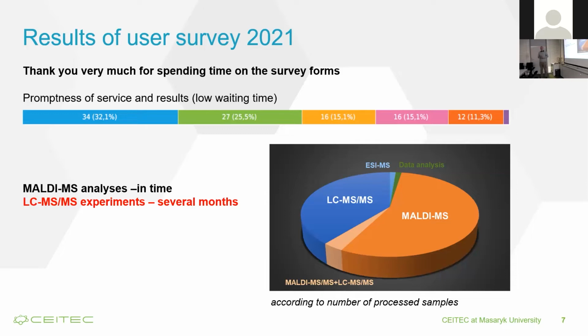I am not going to talk today about parameters which were well evaluated, but I would talk about our long-term problems and the promptness of service and results. I would like to stress that it's only for LC-MS experiments. I believe that users are satisfied with our MALDI-MS.